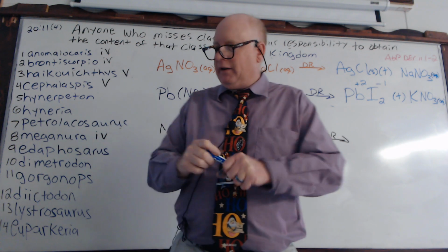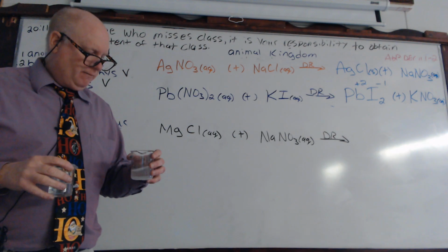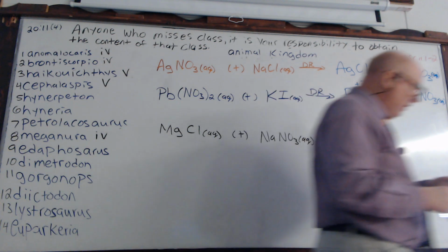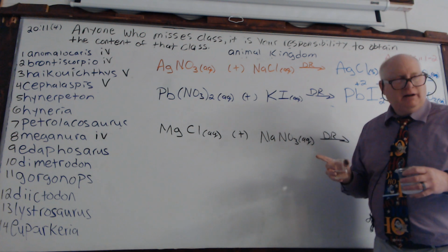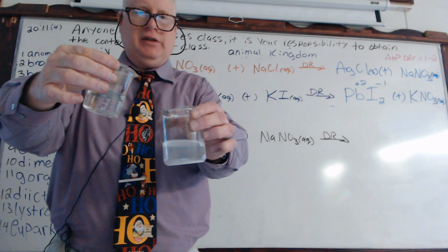So, in this reaction, what we're illustrating here, we've got some lead nitrate. Now, that's just because we put in more of the powder; if we put more and more water in here, this would totally dissolve. Then we've got some potassium iodide as well. Are iodides soluble? Yes, unless, not with lead. Okay. So then what happens if we pour these 2 together?